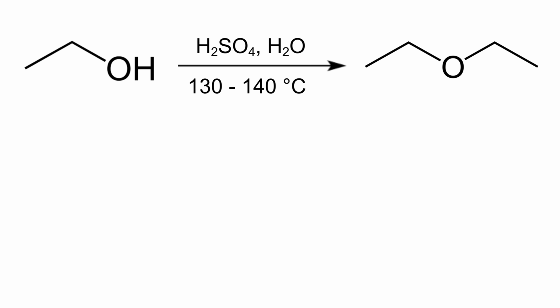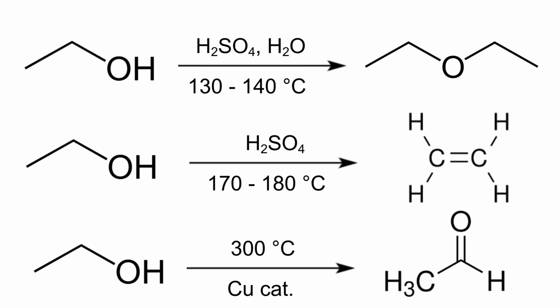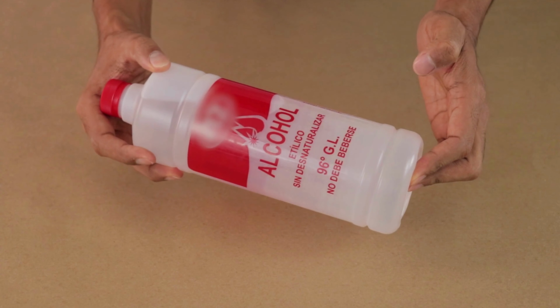Also, ethanol is employed in the synthesis of diethyl ether, ethylene gas by dehydration, and oxidation into acetaldehyde or acetic acid, just to mention some examples. Ethanol is commonly encountered as a 96% solution.